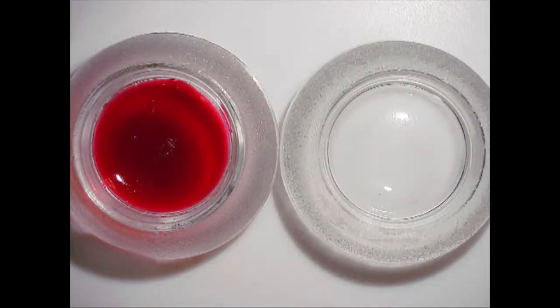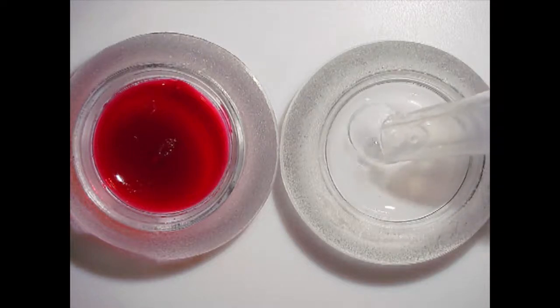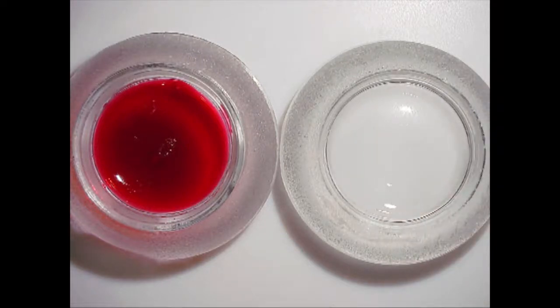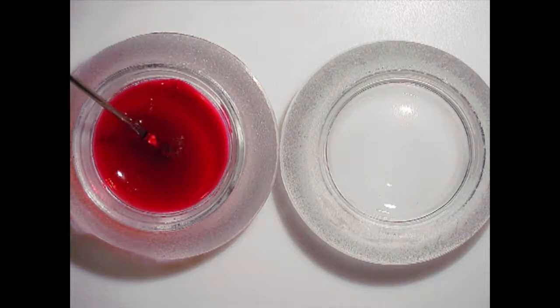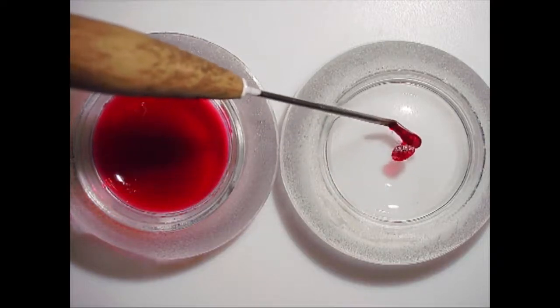Our next step is the dehydration phase. During this step, we'll use 70% alcohol. Here I'm filling the dish up. We're going to transfer the specimen from the stain to the 70% alcohol. I get under the specimen again and move it to the alcohol.